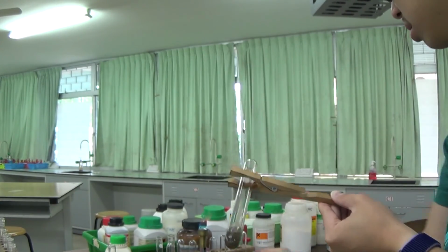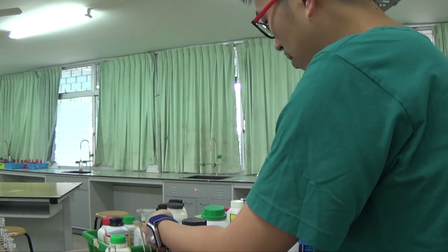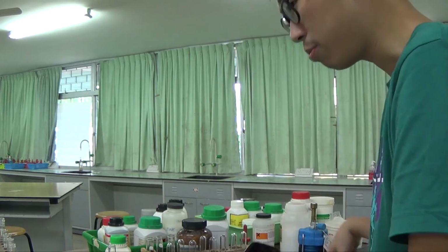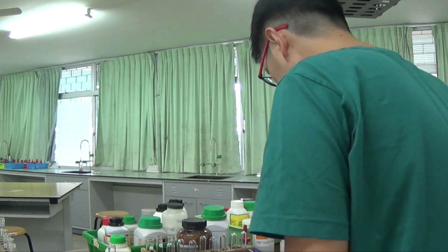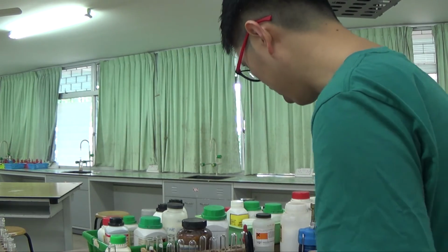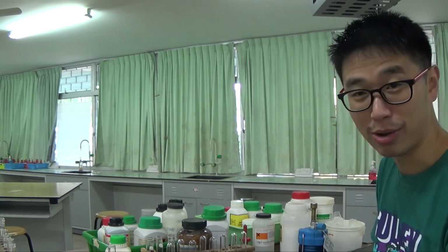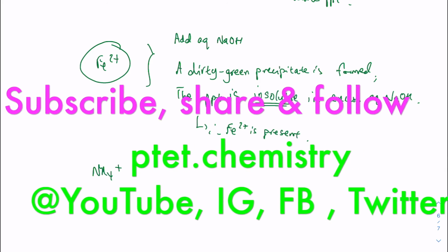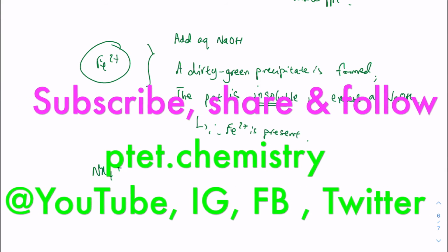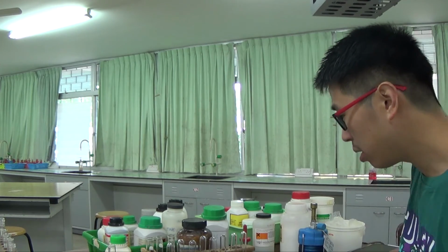Alright? Be careful with fire, yeah? So there's the number one danger in the lab. So I already spilled some stuff here, so I need to wipe them up before I continue any further. Very dangerous when you have spillage in the lab, especially when I've got electronic devices, because I do not want to damage my electronic devices for obvious reasons. Okay, never mind. So all that is done.